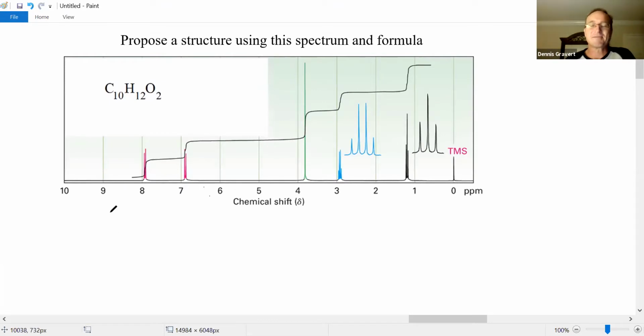All right, let's go and label our data. How many peaks? I got a peak here, second one there, third one there, fourth one here. Ooh, and zoomed in, a fifth one here. Hey, there's a peak. No, ignore the TMS peak. That's not from this molecule.